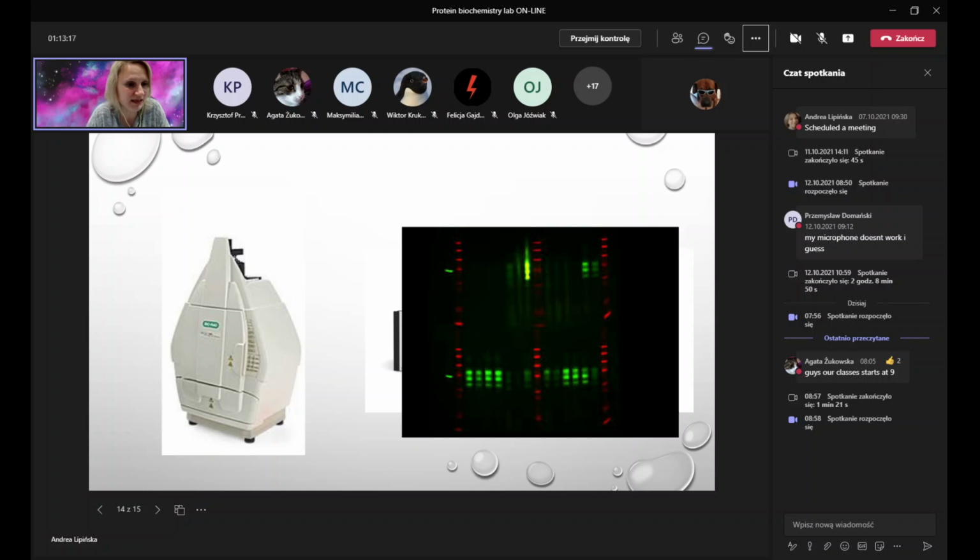If we are having a protein like we have, purified protein, high amounts, low background, then you don't need very sensitive substrates for the detection because your background will be much higher. So you will get a ladder of a protein instead of a single band. Then you choose less sensitive substrates. But if you're detecting a protein which is not abundant in your sample, then you either use lots of material for your gel, or you choose a more sensitive substrate. For example, there is luminol stabilized by coumaric acid, then it's much more sensitive.